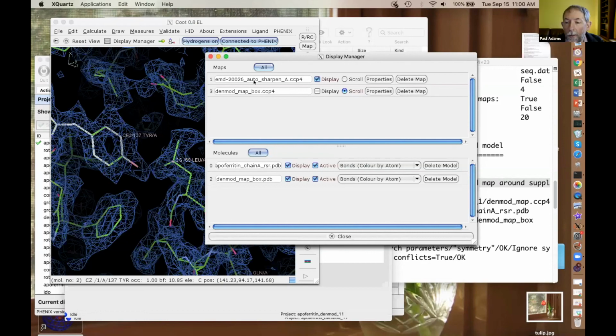Yeah, so last question before we take a quick break. Is there a possibility to input histograms for lipids or detergent? Yeah, so that's on the list, but that's not there yet. So that's a possibility. Yeah, in principle, absolutely. One last question, then we'll have a break, because we do have to get to a break.